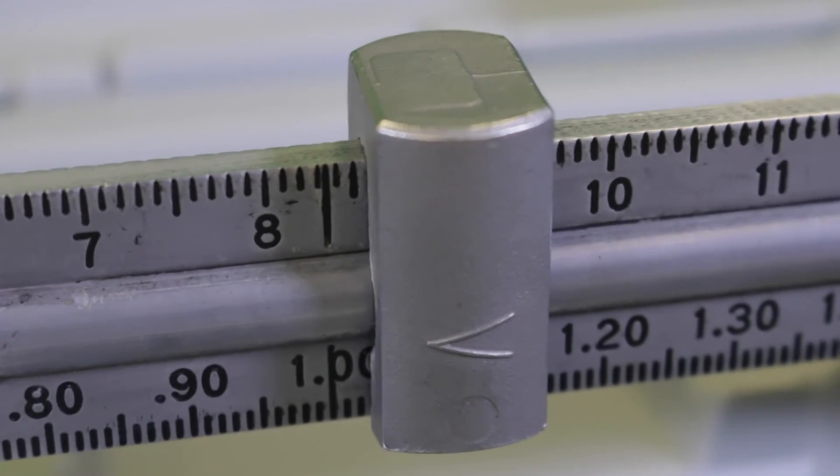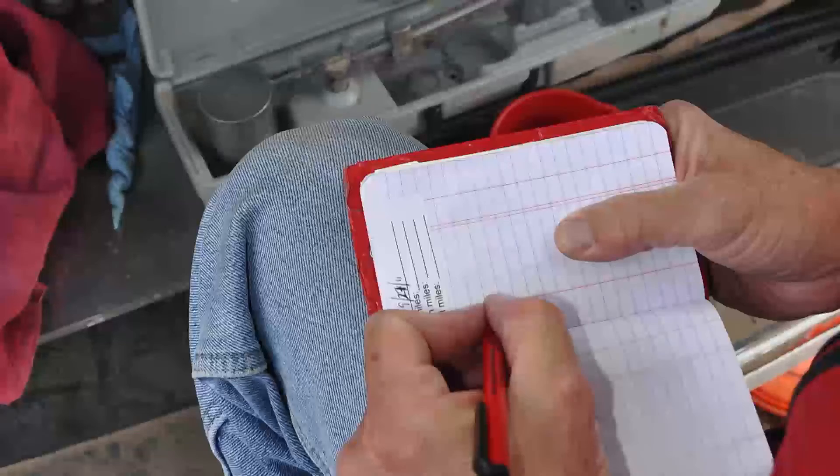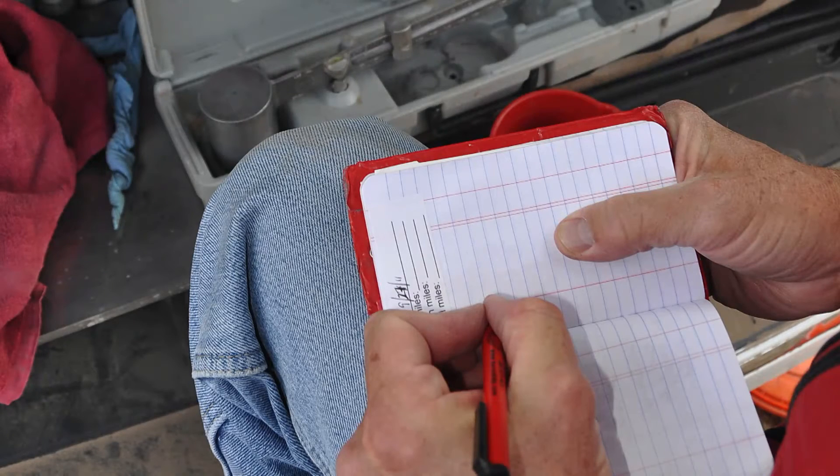Report the drilling fluid density to the nearest 0.1 pounds per gallon, half a pound per cubic foot, or 0.01 grams per cubic centimeter, which is equivalent to specific gravity.